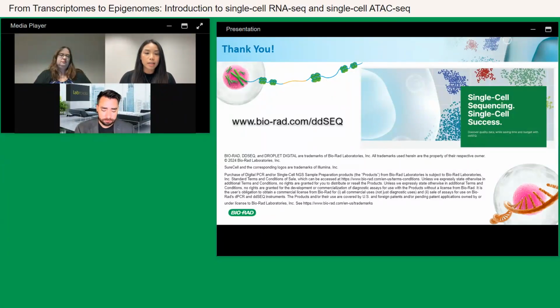Now keep in mind that this is at the stage where we are loading the cells, so you want to take into account all of the treatments that you would want to do to make sure the cells are of the highest quality and viable. If there are any other treatments, like removing red blood cells, cell removal, or any other enzymatic treatments, you want to make sure that before cell loading you have enough cells for that. We would recommend about 150,000 to 300,000 cells.